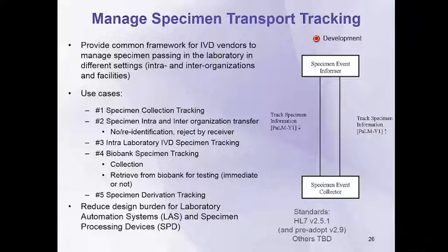Our hope is that it's going to reduce the design burden on the other ancillary systems that otherwise are trying to track specimens within their limited purview of the scope of their software, and instead create a more holistic framework for how different vended systems can more robustly support specimen movement and tracking of those specimens for the benefits of patients and research throughout our healthcare enterprise. Next slide.